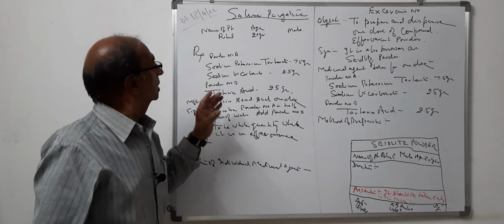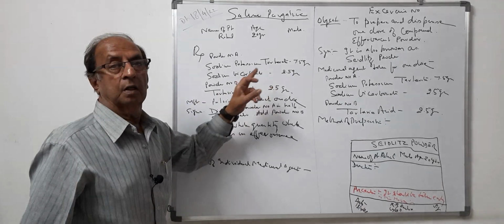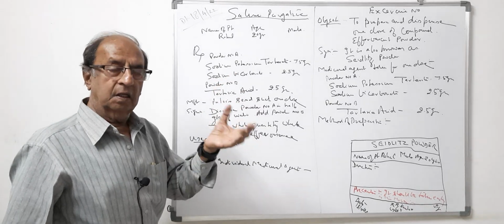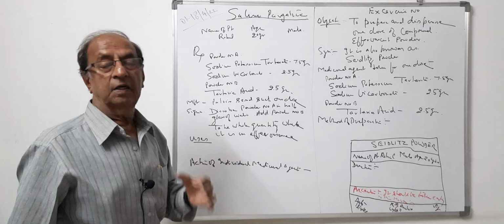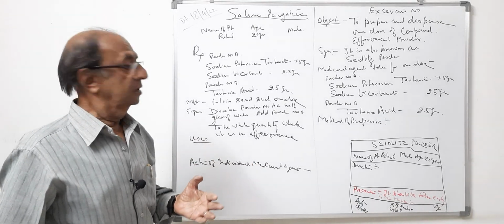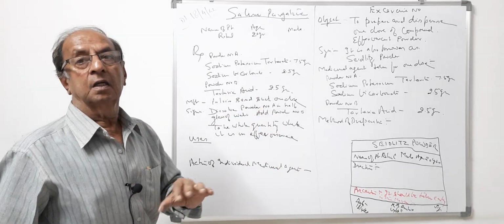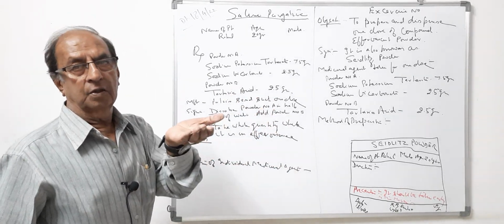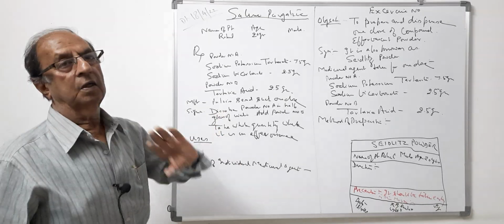Reason being is you are taking about 10 gram of salt. If you take 10 gram of salt as such only without effervescence, you can take it, but it won't have proper taste. So while effervescence, you can very easily take it. While carbon dioxide is being evolved, you can take the whole quantity.